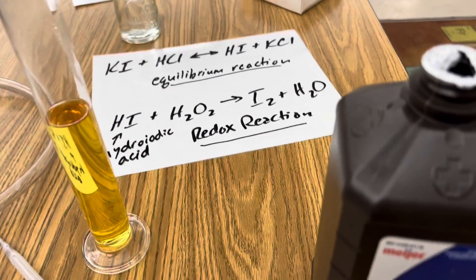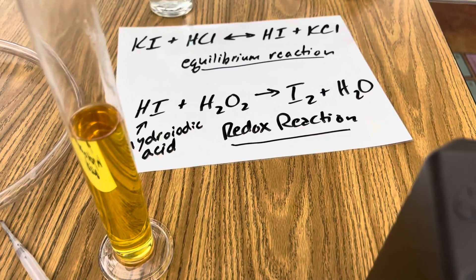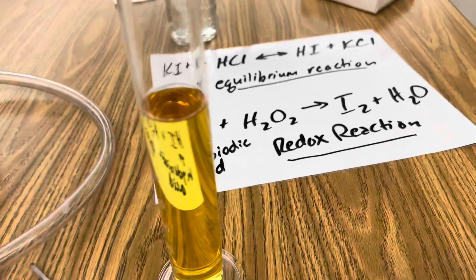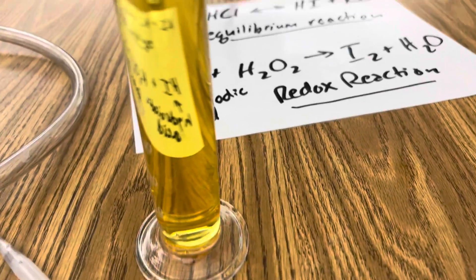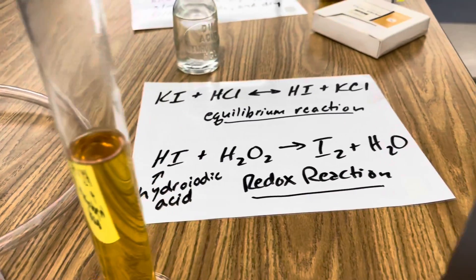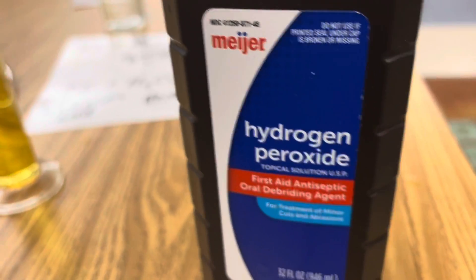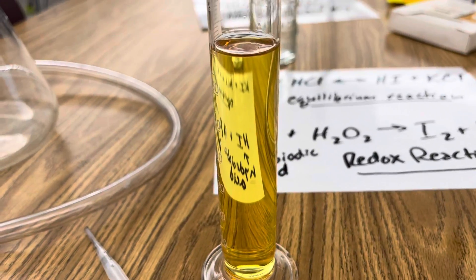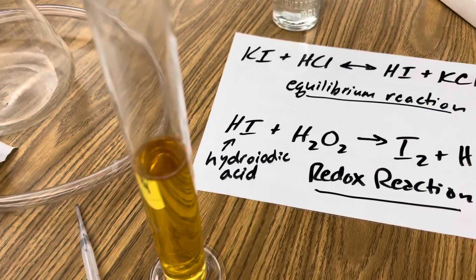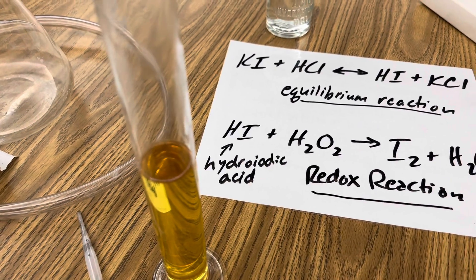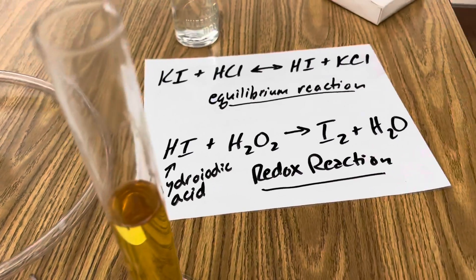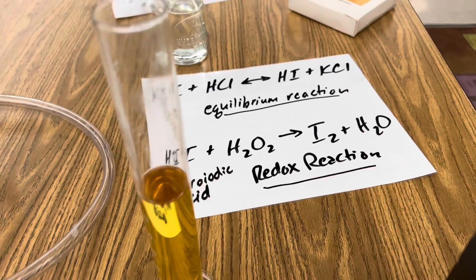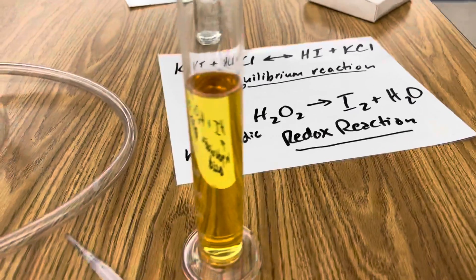This is the second part of our extraction. I transferred the solution to this graduated cylinder so you can really see the precipitate of iodine. All I'm going to do is add 3% hydrogen peroxide to our graduated cylinder and you'll actually see iodine precipitate out of the solution. This is where the hydroiodic acid is oxidized by the hydrogen peroxide, which just leaves iodine and water in our graduated cylinder.